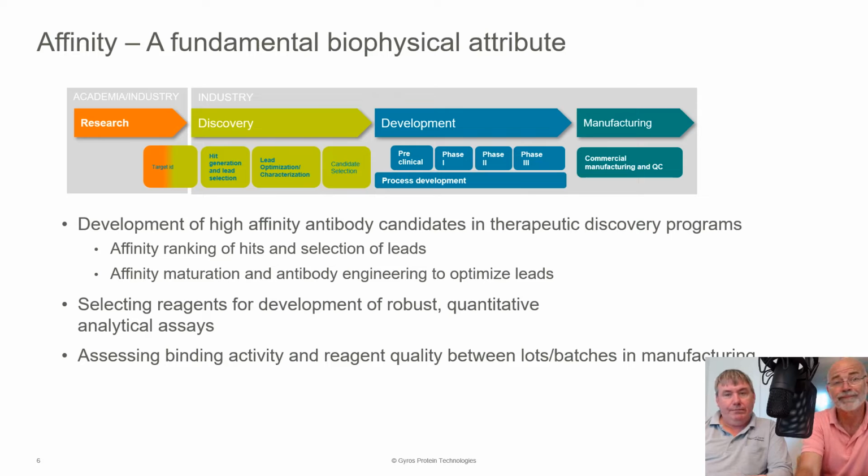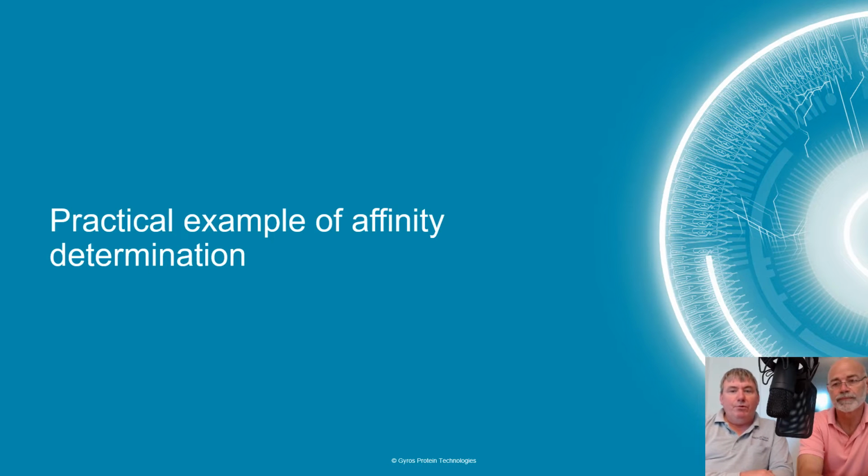Right. So now we're really going to move forward and go through our practical example of affinity determination to give you key aspects of how you design the experiment and how you set it up on the Gyrolab system.